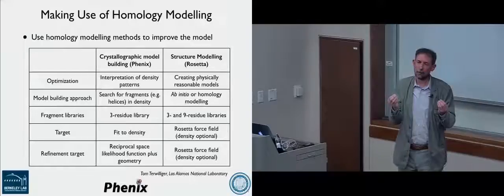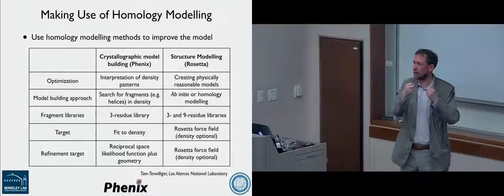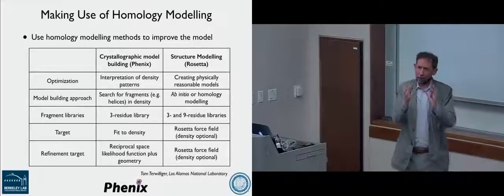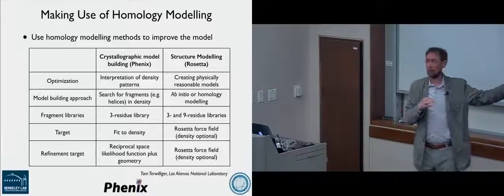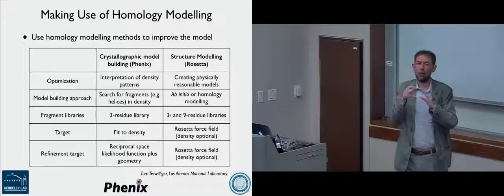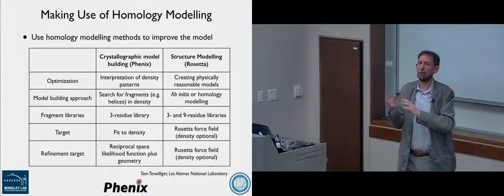But as part of that process, what they have to do is they go from a very simplified representation for a model, with single balls for side chains, just a few atoms for a side chain. They have to go from that to a full atom model, then take that full atom model that they've created, which is fairly inaccurate, and then optimize it and make it more like a native protein. So that's what's been exploited here. That second part, trying to take an inaccurate all-atom model and make it look more like a native protein structure.